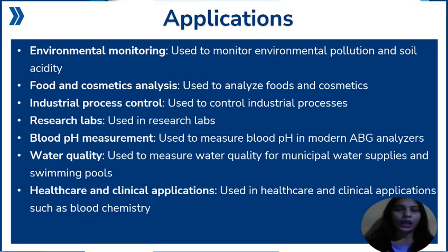The applications of this experiment are environment monitoring, used for monitoring pollution and soil acidity. Food and cosmetic analysis, used to analyze food and cosmetics. Industrial process control, used for controlling processes in industries.